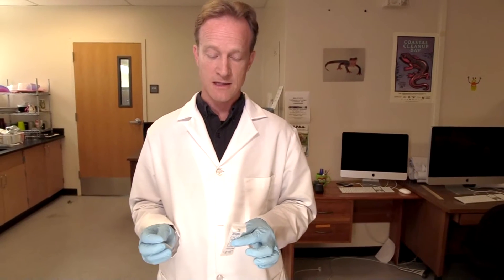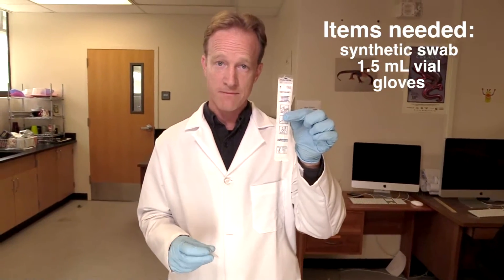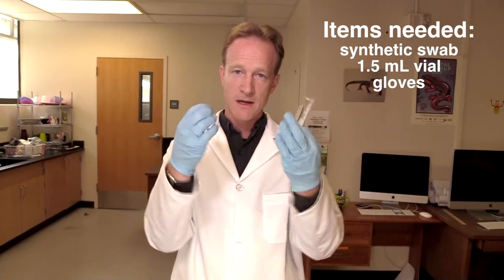So what you need to collect these data are an actual skin swab, a vial to go with it, and a pair of gloves.